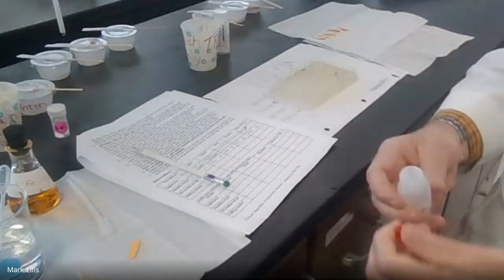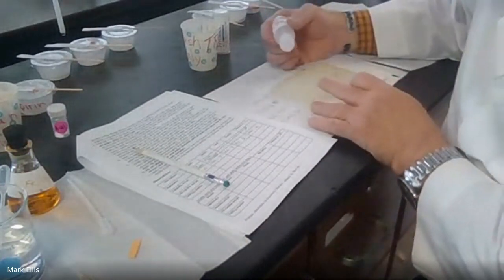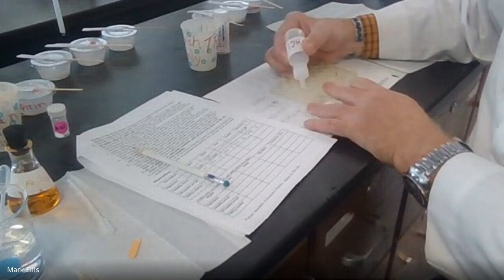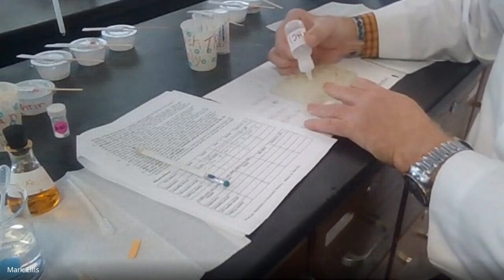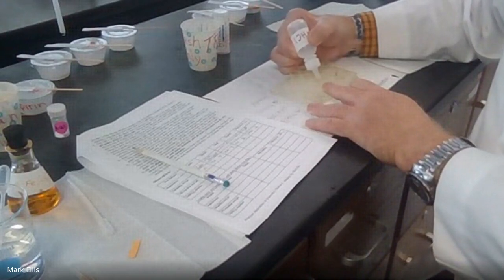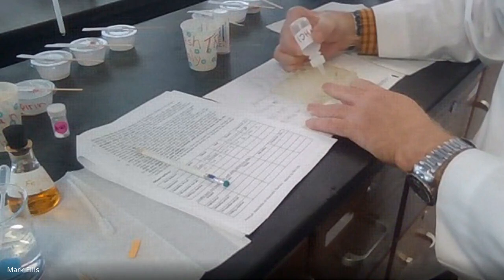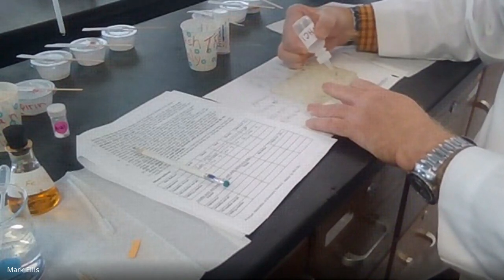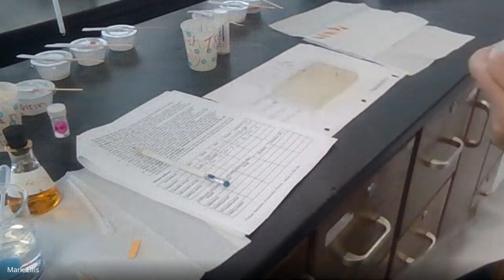So I'm going to take the cap off. We're going to do about 5 drops. 1, 2, 3, 4, 5. I think a couple of those I only had 4 in. That's good enough. Put the cap back on, put it away.